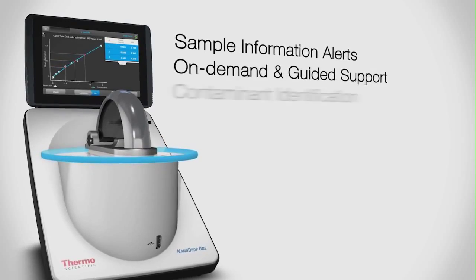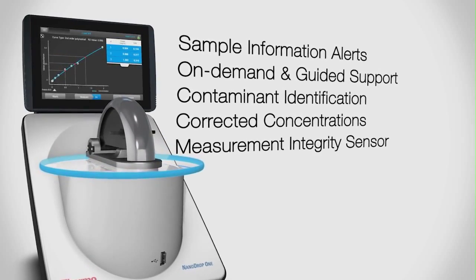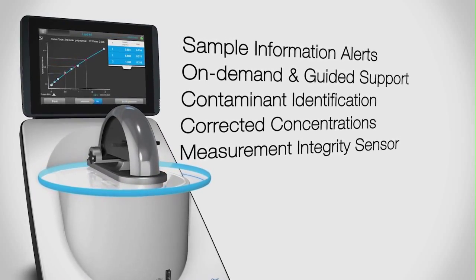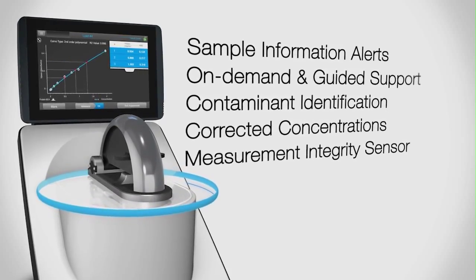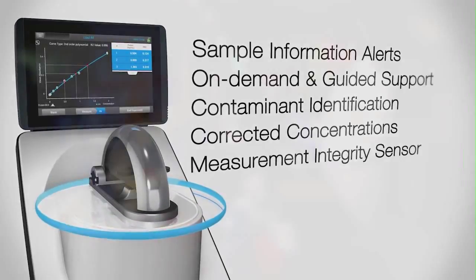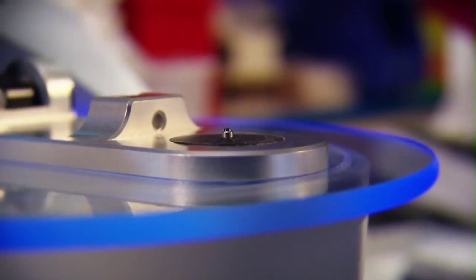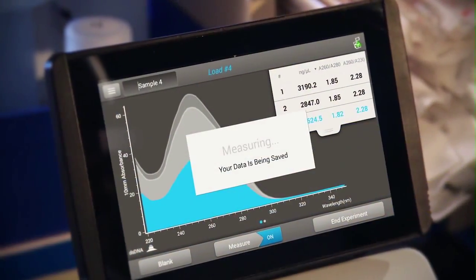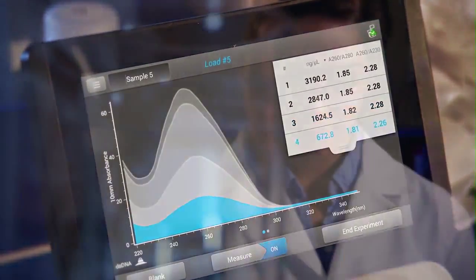Make enlightened decisions with more information from NanoDrop 1 instruments and qualify your sample in seconds before you run your next experiment. NanoDrop 1 UV-VIS micro-volume spectrophotometers. Build confidence with sample intelligence that brings you one step closer to success.